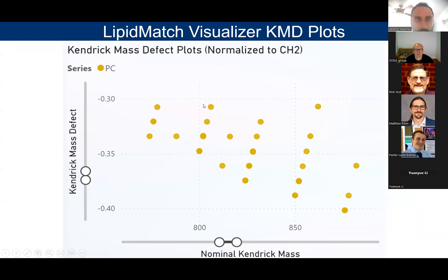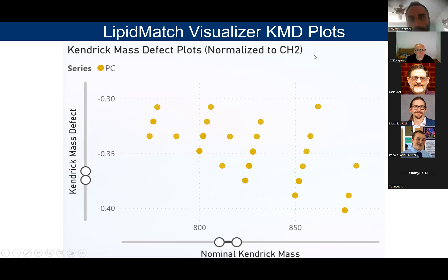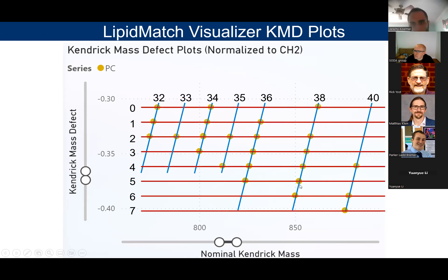Now let's look at the visualizer. One component some of you may not be familiar with is the Kendrick mass defect plot. Instead of normalizing the periodic table to C12 where carbon-12 is 12.00, you normalize to CH2, which would be 14.00. So now any mass defect is related to heteroatoms, phosphates, different head groups of your lipid, as well as unsaturations. You get a really cool pattern where going diagonally you get more degrees of unsaturation, and going horizontally you get increasing carbon numbers. You can automatically tell what types of lipids may exist in your dataset, even if they're not annotated by MS/MS.